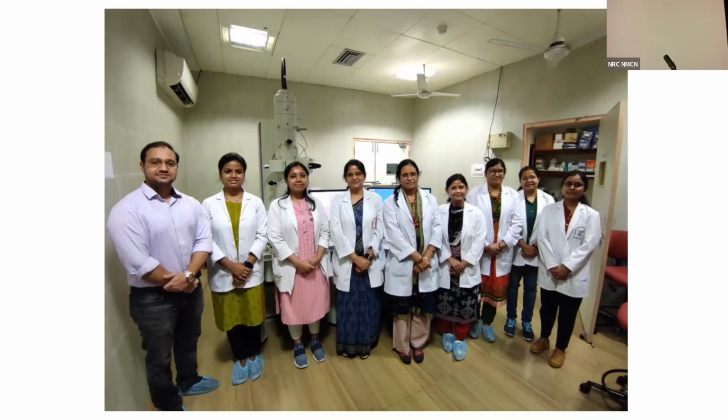In electron microscopy, antigens can be targeted and you can combine it with gold particles. There are different methods. But yes, because it is a very technical thing, you will have to see what is the best protocol. It's time.